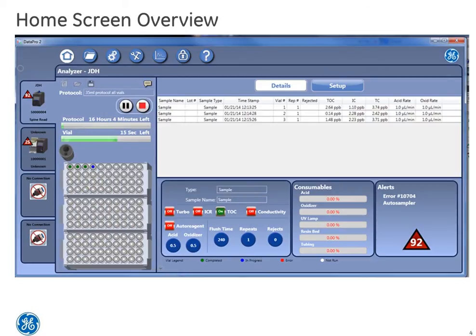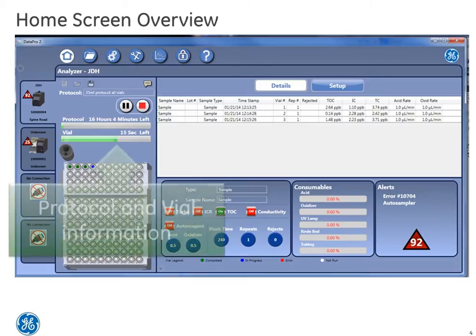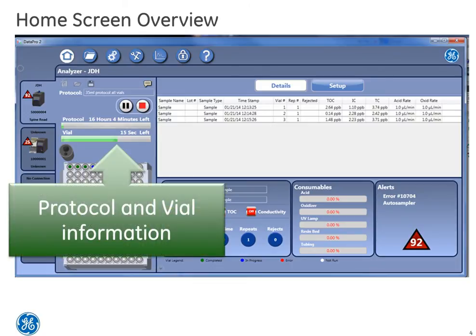One key element is the protocol and vial information located above the autosampler rack display. This information provides you a snapshot of the time left for the current protocol and the remaining time left for the current vial being analyzed.